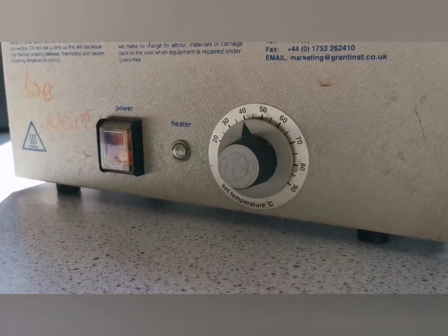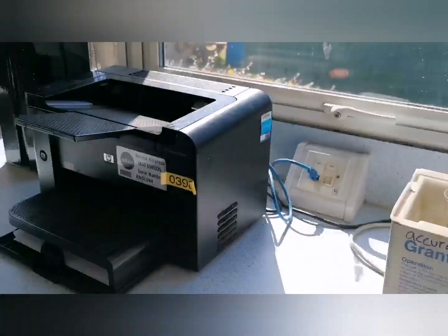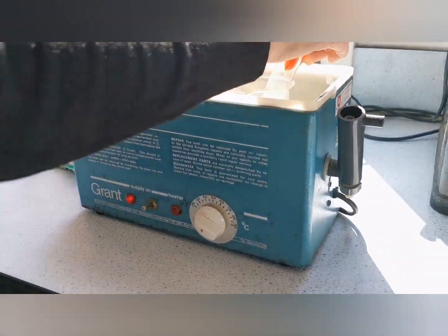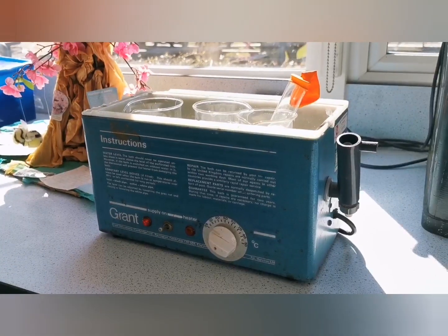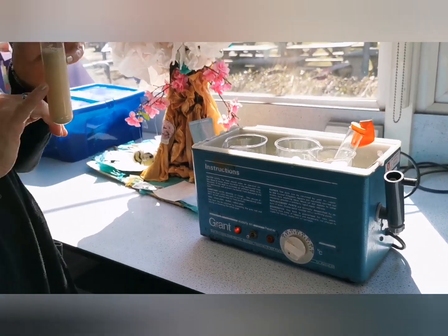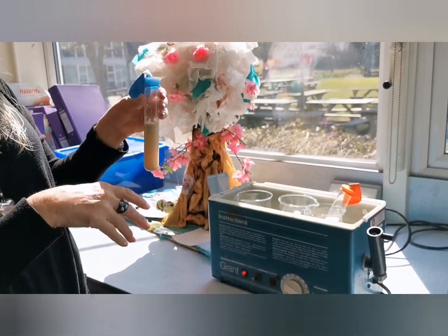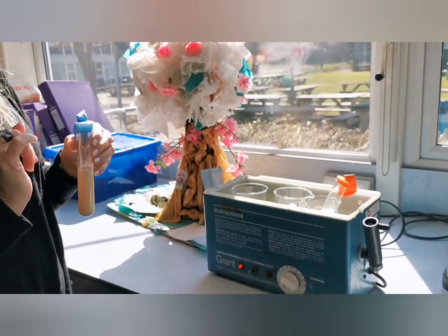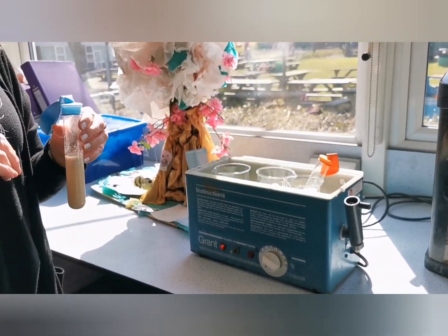This one is at 40 degrees. This is the sort of temperature that our bodies like. We like to be around about 37 degrees. And this one here is at 20 degrees. And I'm also going to go and find some ice. Actually, I'm going to put this one in the fridge to see what effects really cold have. So most fridges are around about 5 degrees Celsius. So I'll put this in the fridge and see the effect of this one. So we'll come back to these later and see if any gases have been produced.